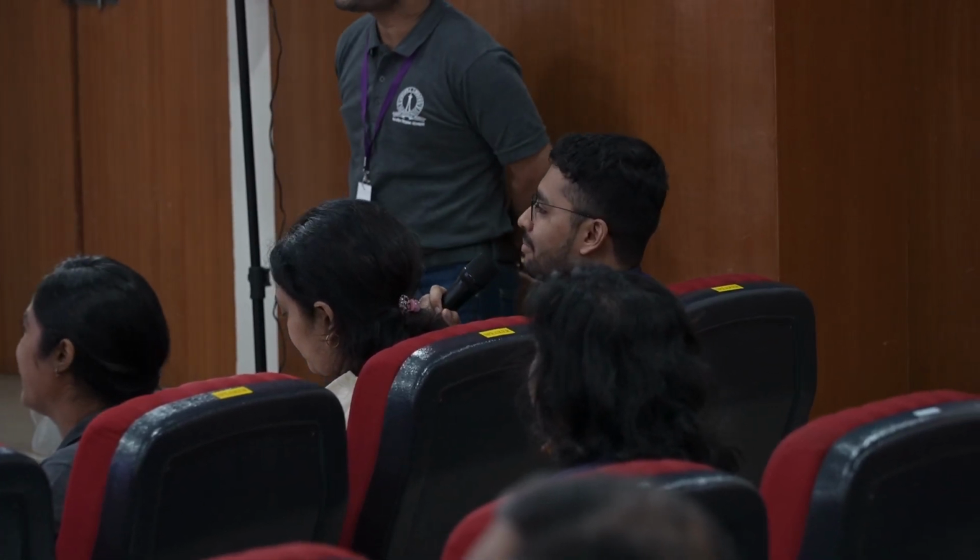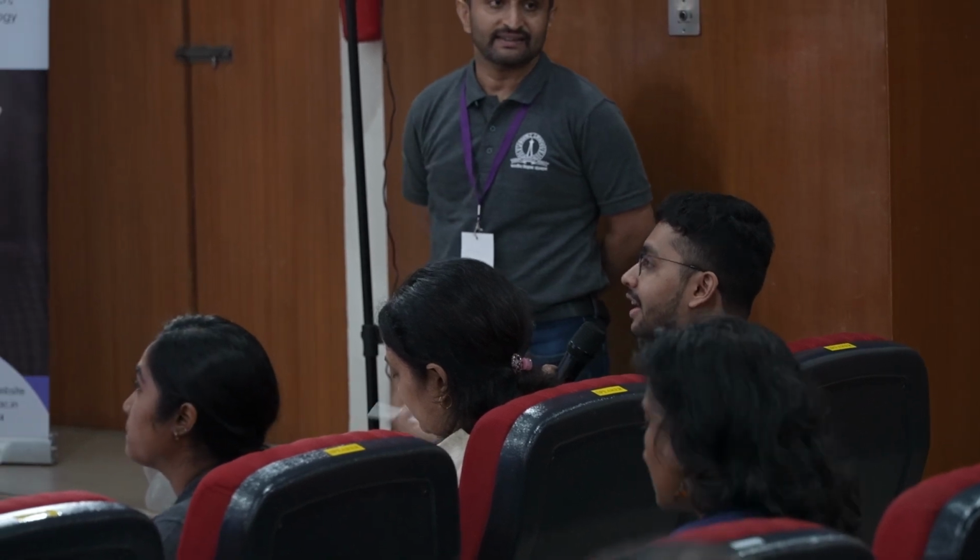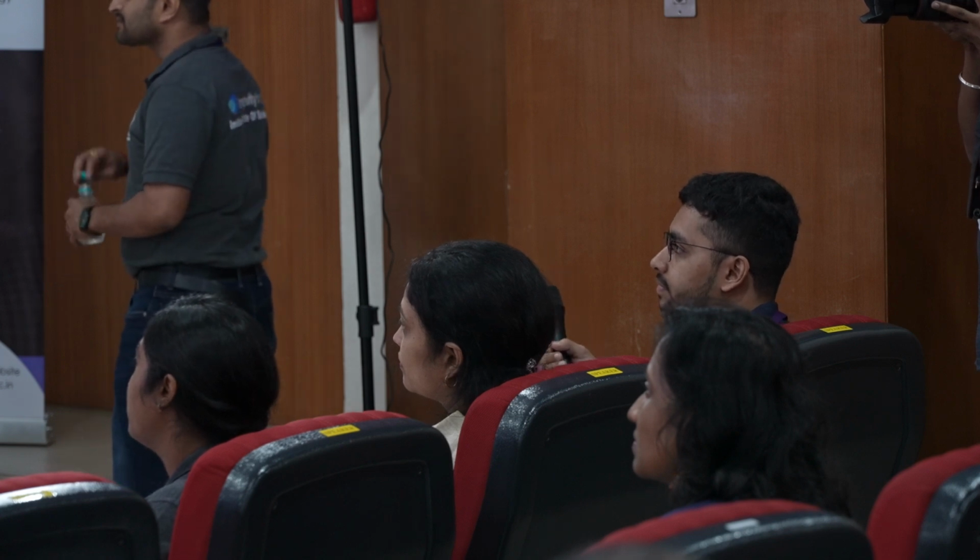Great talk, and we've been using your product for running our samples. An issue we face is the red blood cells that are present. We usually lyse them and then run the sample. But your DuraClone product states that you don't need to do it, and still there's a lot of noise that is generated. So is there any workaround? I mean, you need to remove the red blood cells.